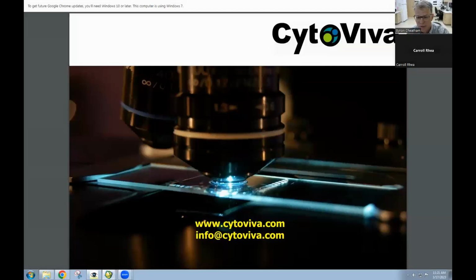I will say, though, that if you're using paraffin-embedded tissue, if you can deparaffinize, do it. It works a lot better and just makes it a lot easier. If you can cryosection tissue, that's even better. The less potential interference, the better the images are going to look, and the easier it is to get to the data. But we can work through the resin soup sometimes, or oftentimes, to do that. Avoid it when possible.